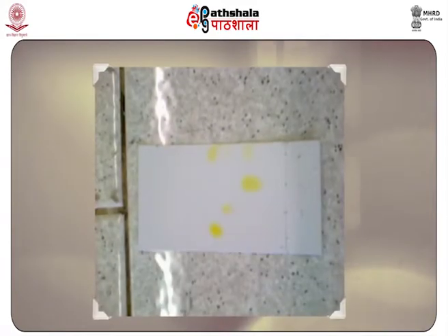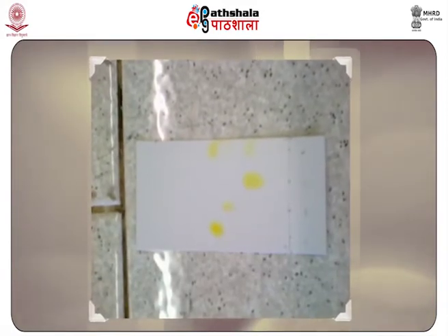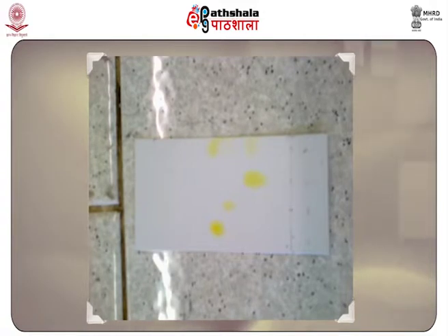Thin layer chromatography, or TLC, is a chromatographic technique that is employed in separating a mixture of non-volatile substances. TLC is performed on a sheet of plastic, aluminium foil, glass, etc., which is coated with a thin layer of adsorbent material, generally cellulose, aluminium oxide, or silica gel. This adsorbent layer functions as the stationary phase.